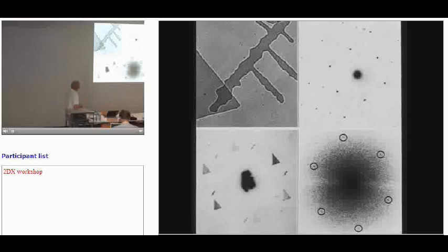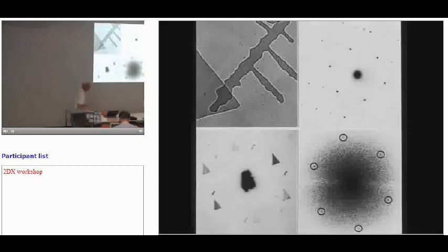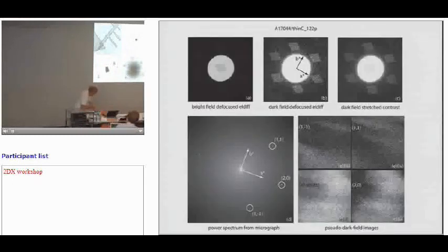So if you take a picture of paraffin, you have to be very bad not to get a spot at 4 angstroms. So this is the same electron diffraction pattern, again defocused, and you can see these little fragments. We put the beam on it roughly on here. This is the edge of a grid bar actually. So that's the little triangular crystal, and that little bit is that little bit in there. And then here's an optical or computed diffraction pattern of an image showing you the diffraction spots. And what we found was these spots are just as bad in terms of their intensity compared to what they should be as the images of the bacteriorhodopsin pattern were, a few percent.